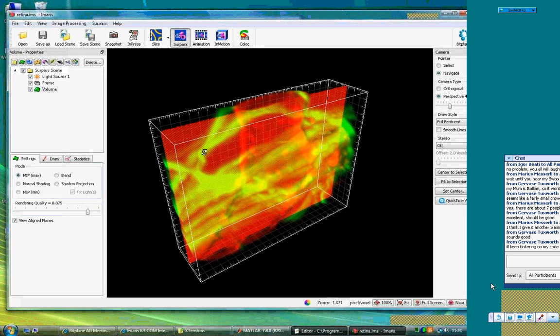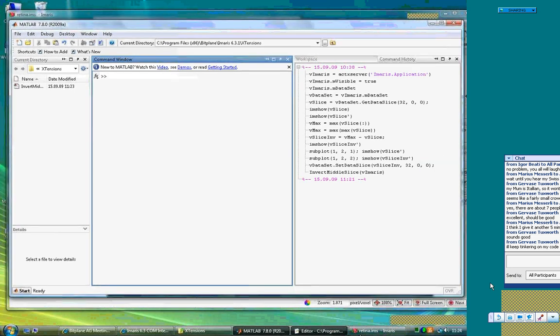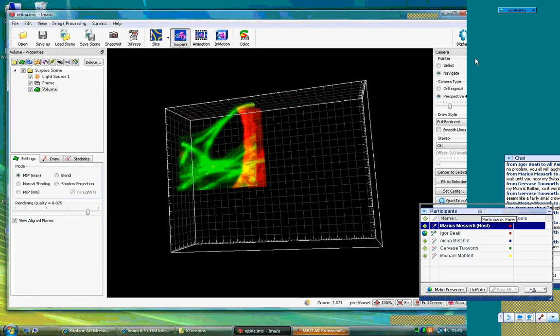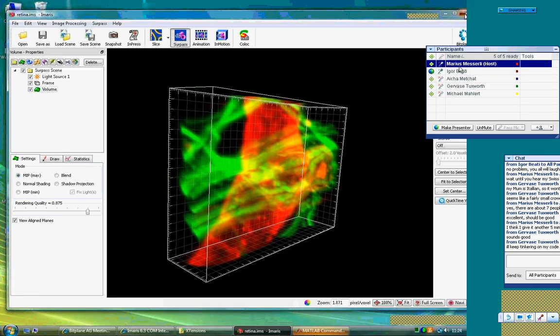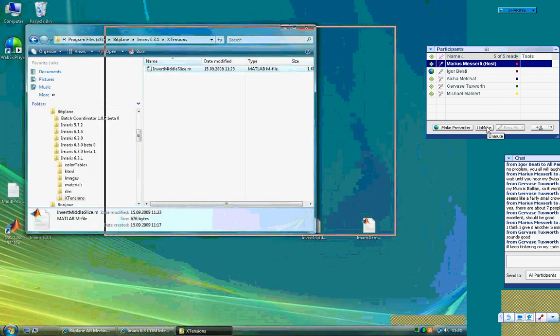For the Imaris dataset, we have seen how to access the data, modify it, and set it back, and how to build an extension from that. So you have to see, here you can even close MATLAB and InvertSlice will work. Now we can go restart MATLAB.